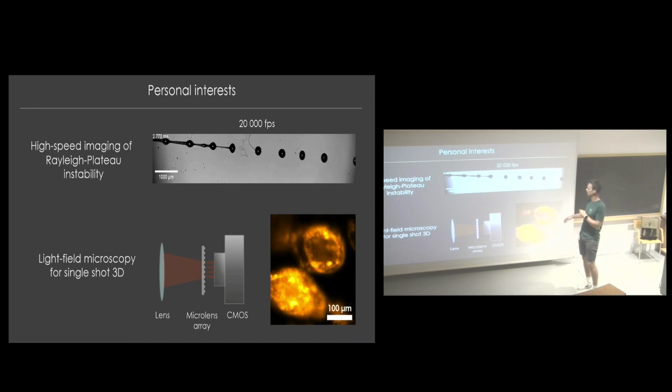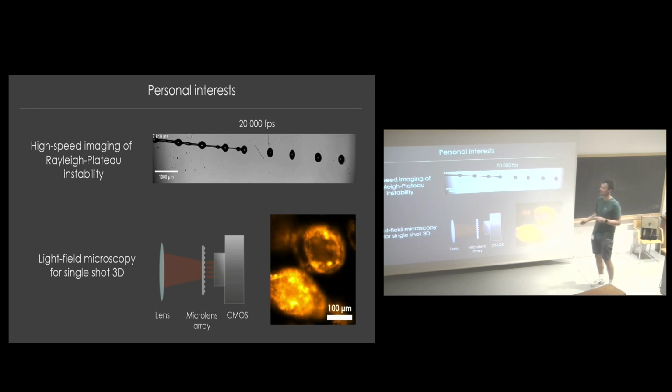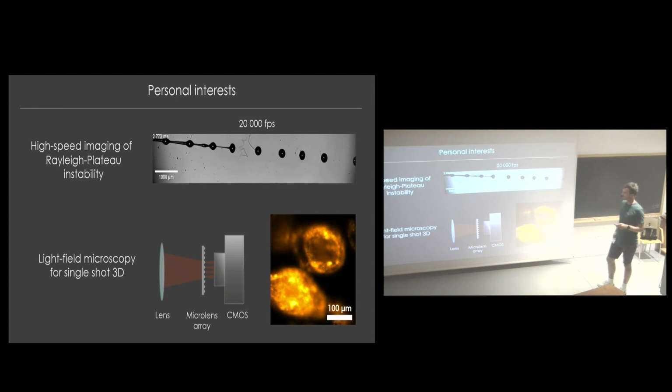And then we have a calcium bath here, and when it enters the calcium bath, we have a capsule, and the cells are inside. And then they can grow for days or weeks. What we want to do is to have a really monodisperse population of organoids like this. So we are interested in this instability, to control it with an electric field, with other parameters. So that's one part of my activities.